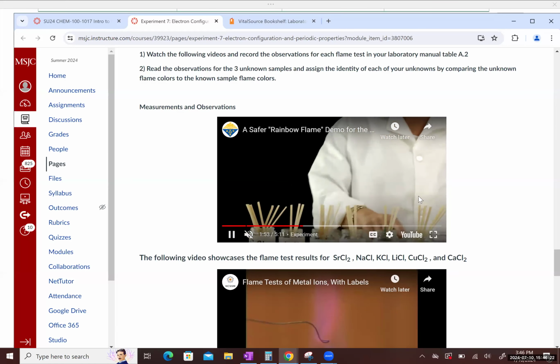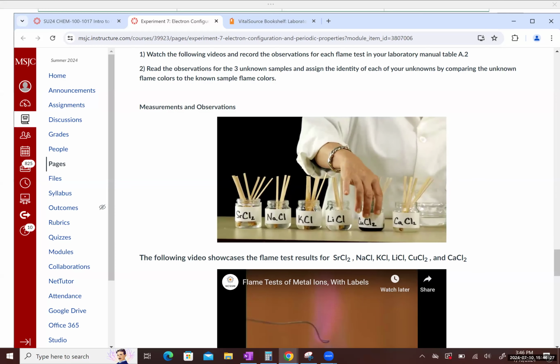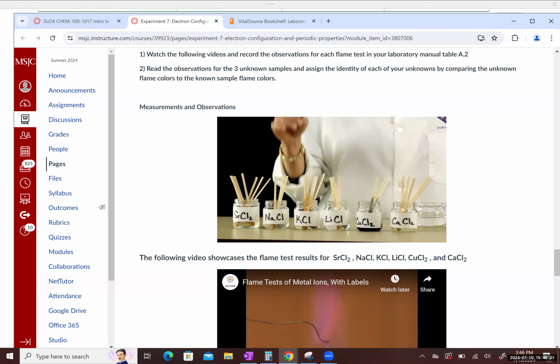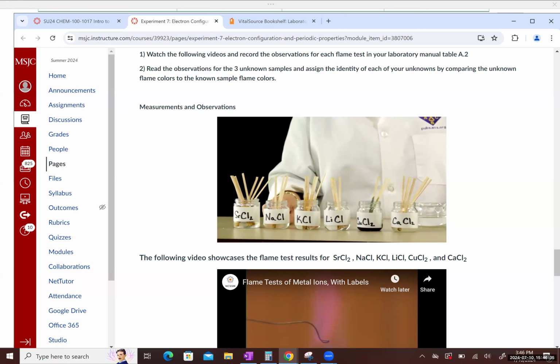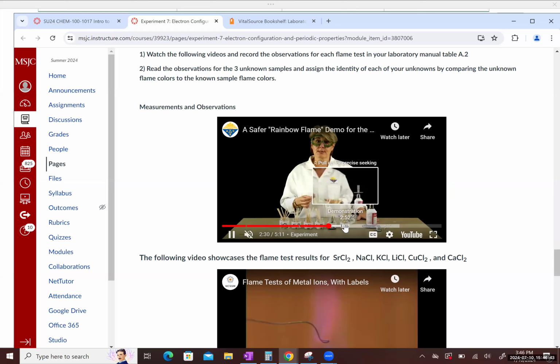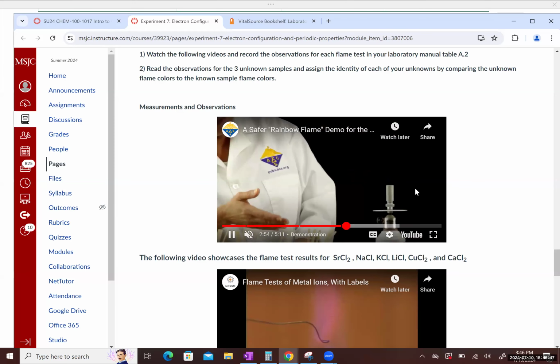Okay, so this is a classic flame test video. So they have a range of labeled solutions, and we're going to be taking these solutions and placing them into the flame. So I'm just going to skip ahead a little bit, talking a little bit about the experiment, and now let's move on to the actual demonstration.